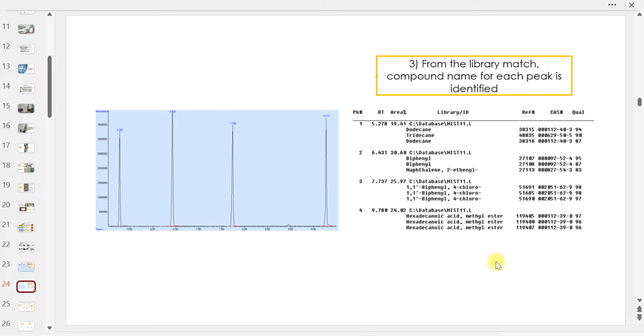Selalunya bagus je. Cuma yang lain tu mungkin unknown. Maksud dia mungkin new compound ataupun library tu yang old. Ni okey je sebenarnya. Cuma you kena bagi tahulah berapa compound yang unknown you dapat.